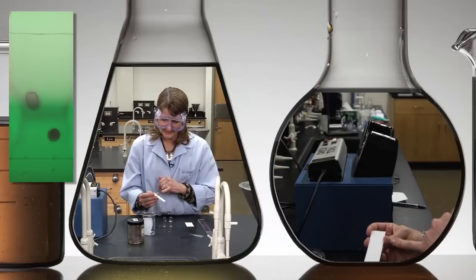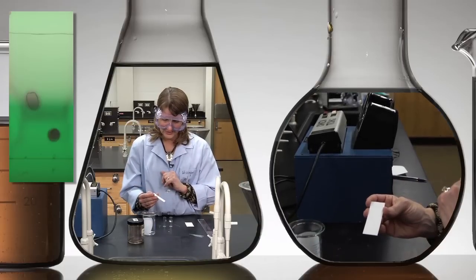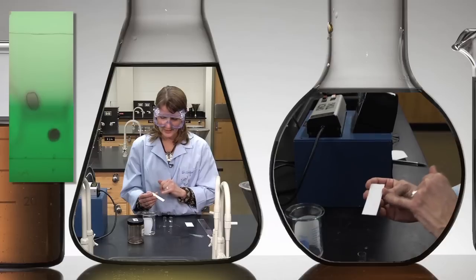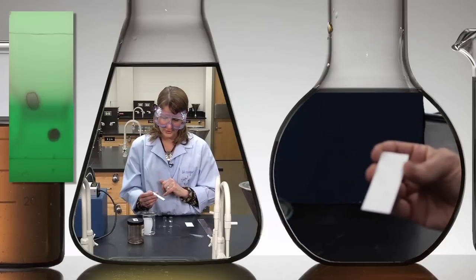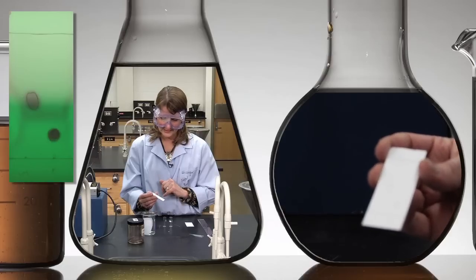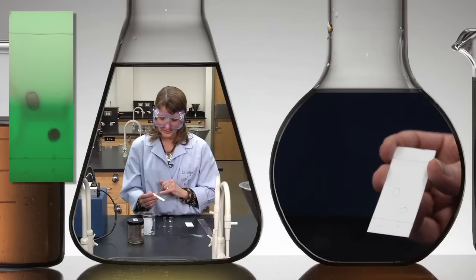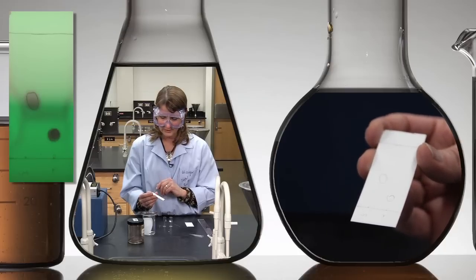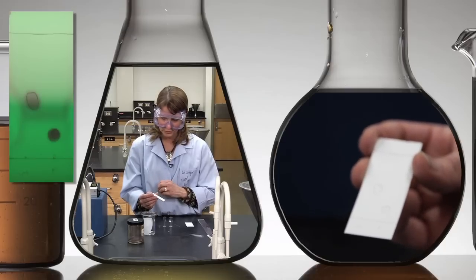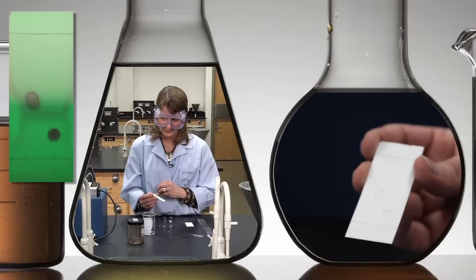Here you can see the starting material has a higher RF value than the product. This is pretty good distance, or I've chosen a pretty good solvent system in that the starting material is about in the mid range of the plate. I could have even used a little more polar solvent to move both spots a little higher.